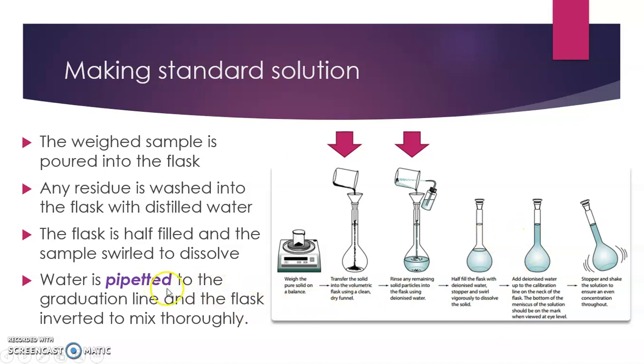Pay attention, it's not just added, it's pipetted to the graduation line so as to make sure that you do not go over. Once you have done that, then the entire volumetric flask is inverted to make sure that everything is mixed thoroughly. And then you leave it there.